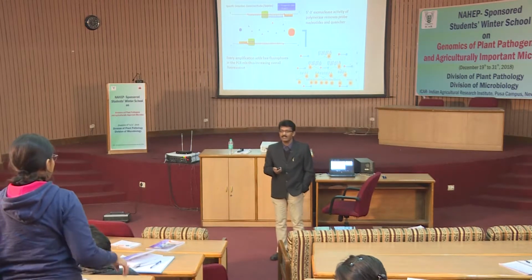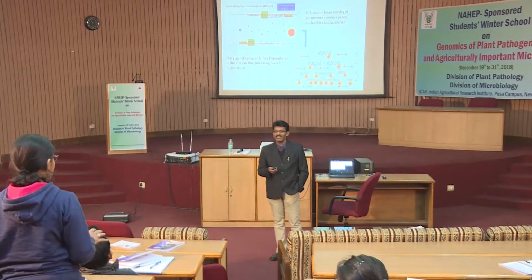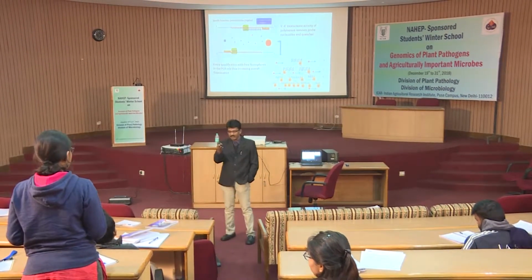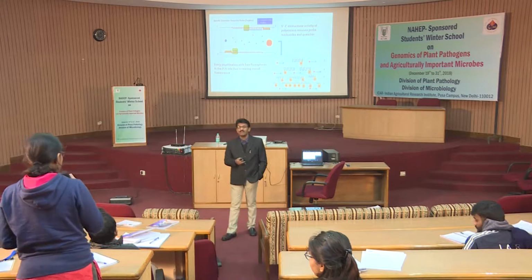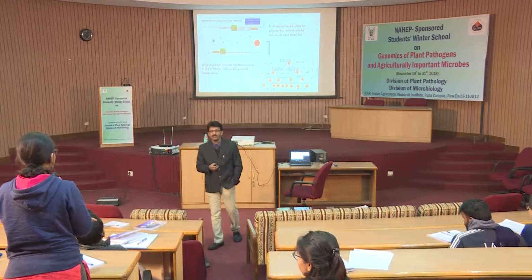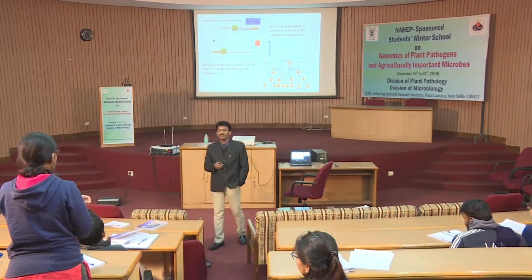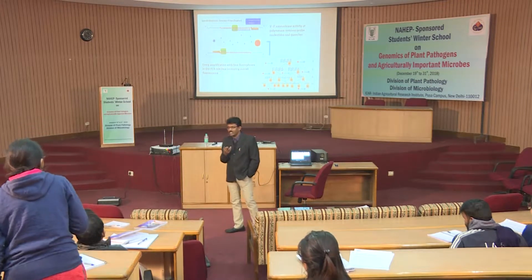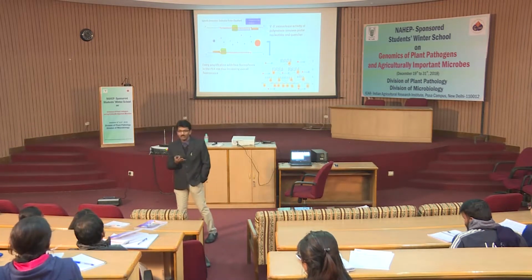Suppose you go to RT-PCR versus going for normal PCR and quantifying it using endpoint analysis. What is the significance of the Cq value, and what is the significance between these? Yeah, we'll come to Cq value. You introduced another terminology, Cq values. I never talked about it so far.